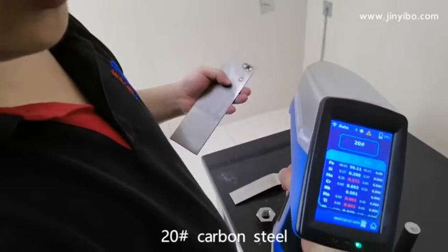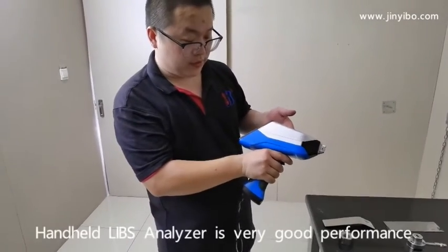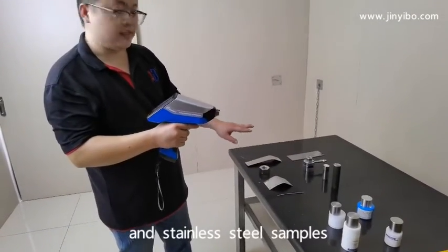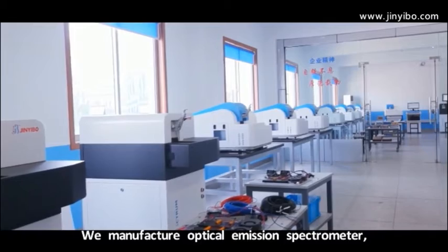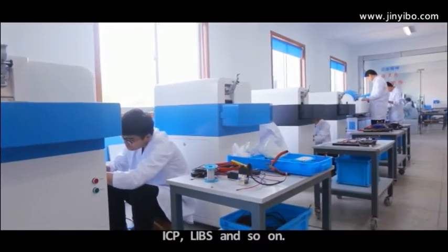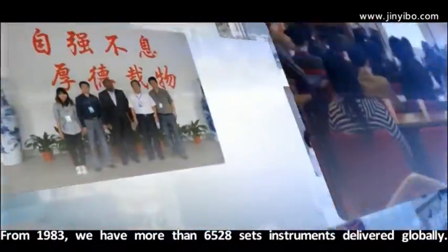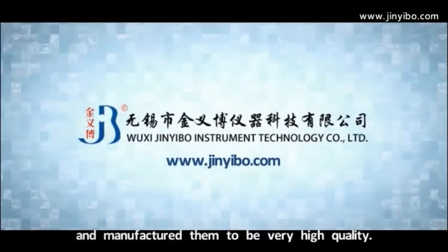40, 20 carbon steel. You can also see our Expert 1 Laser Metal Analyzer can have very good performance on low-alloy steel, carbon steel, and stainless steel samples. We manufacture optical emission spectrometers, carbon sulfur analyzers, X-ray fluorescence spectrometers, ICP, LIBS, and more. From 1983, we have more than 6,000 sets of instruments delivered globally. Now more than two customers choose us every day. We focus on innovation of advanced products and manufacture them to very high quality.